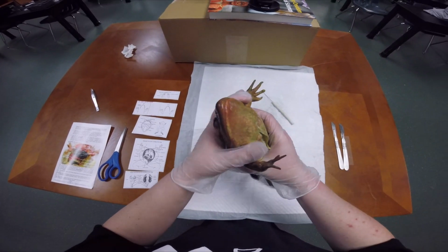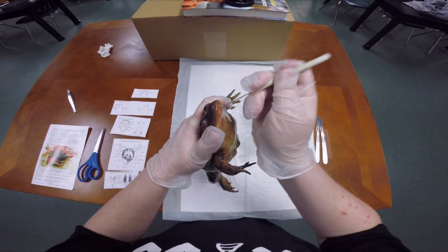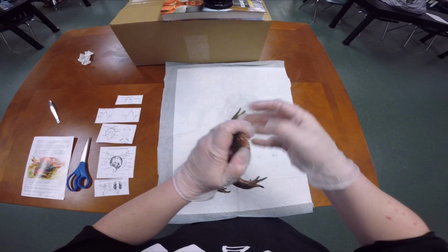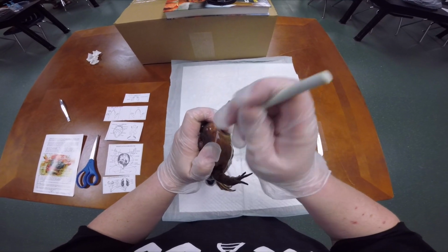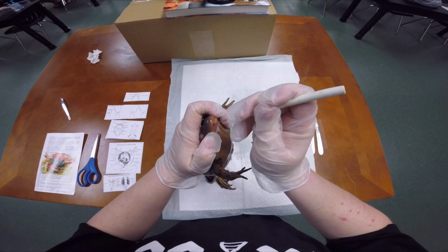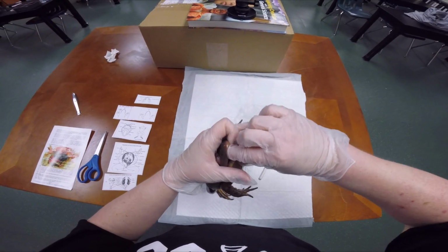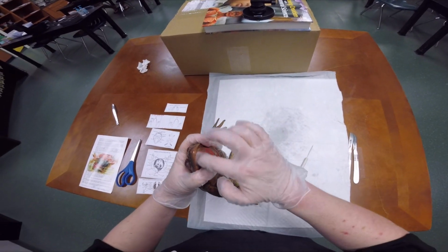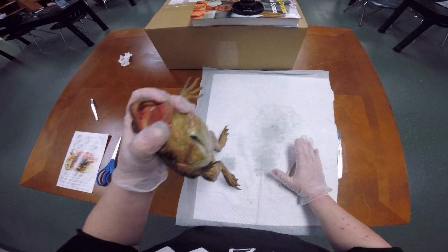So now I'm going to try my best to open up the mouth, which, once an animal goes into rigor mortis, becomes very difficult to move. So I'm going to give myself a little help here. Once we get in there, we're going to open that mouth up. Okay, and he's got some dirt in there, and that's okay.